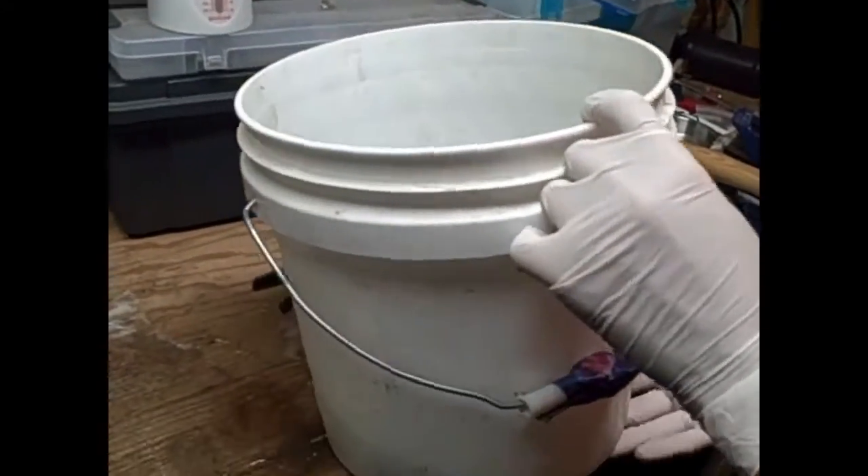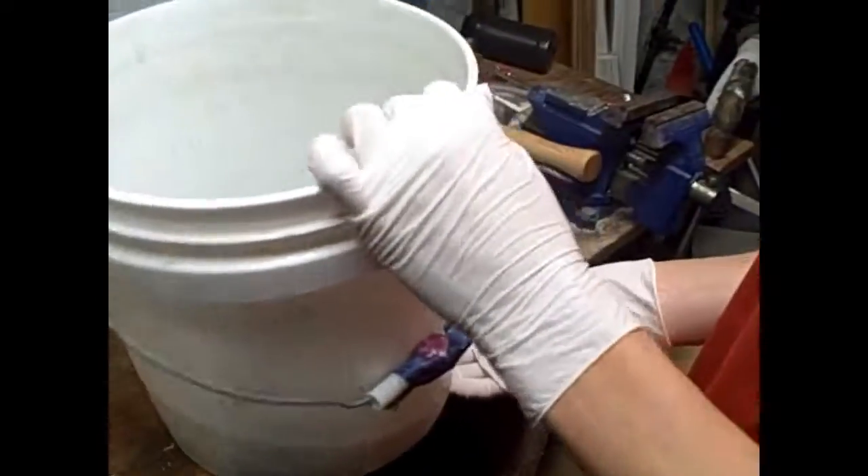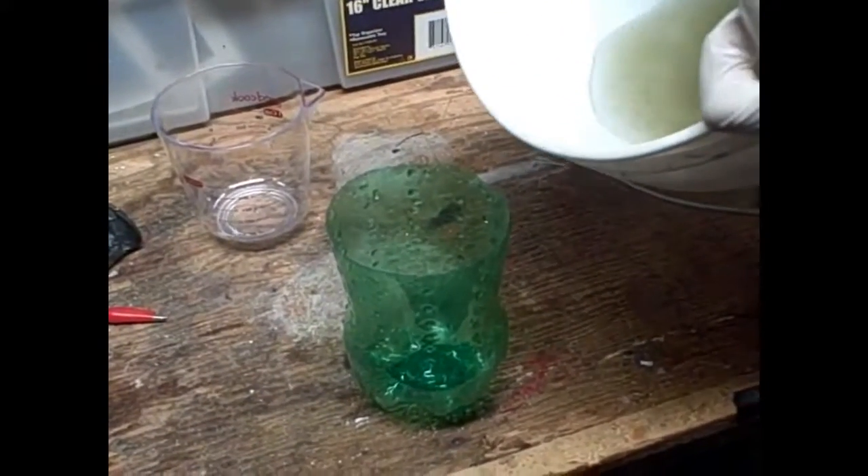Alright, hello everyone. Today we're going to be doing electrolysis of lye. We don't really know what that green stuff is, but we're going to ignore it and pretend it doesn't exist. We got the lye from the last video and we're going to use it as our electrolyte.